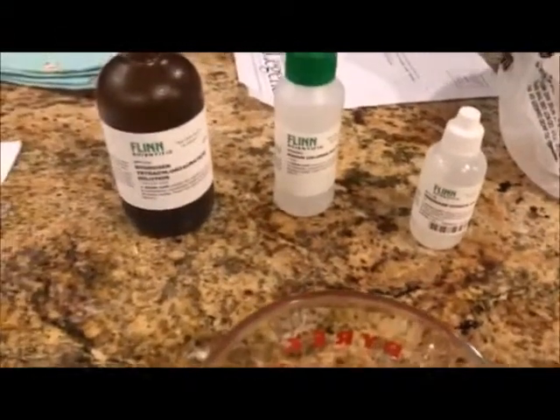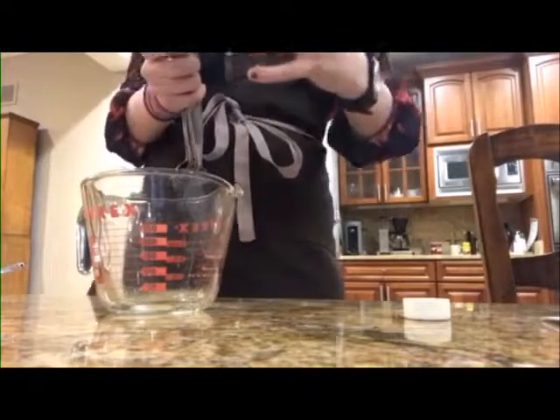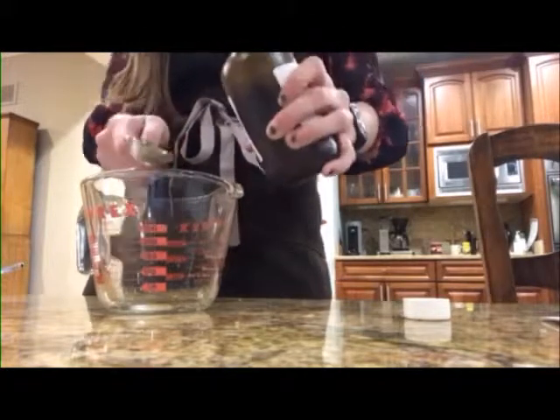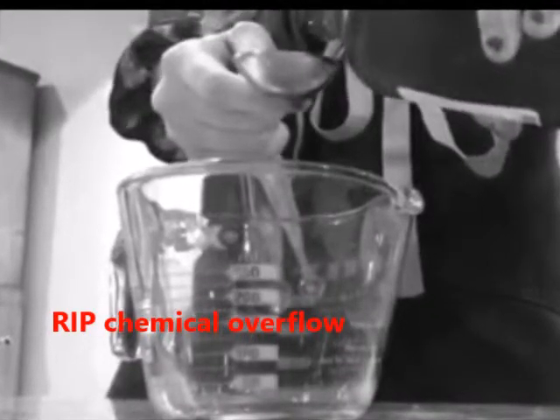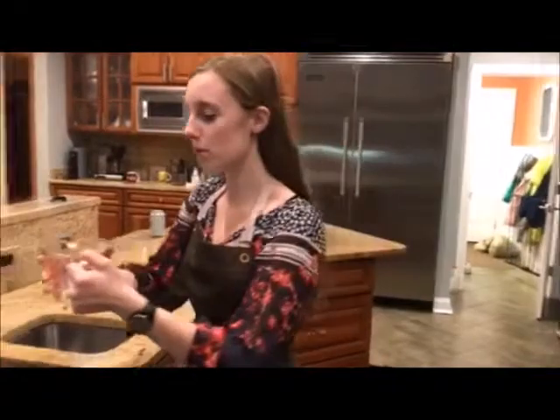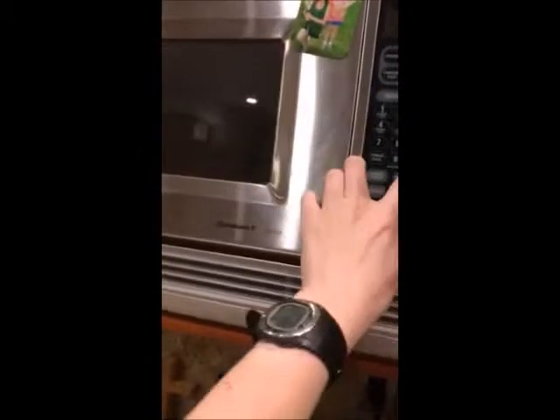I've got my chemicals to make ruby gold colloid. Okay, and we're going to add 20 milliliters of the hydrogen tetrachloroaurate. Next, we're going to fill it up till it hits 200 milliliters. Perfect. Then we're going to want to nuke it for 30-second intervals. You're going to want to stir it at every interval.